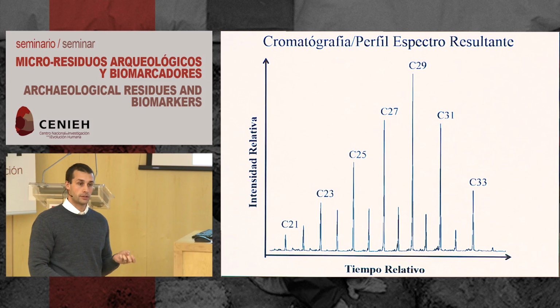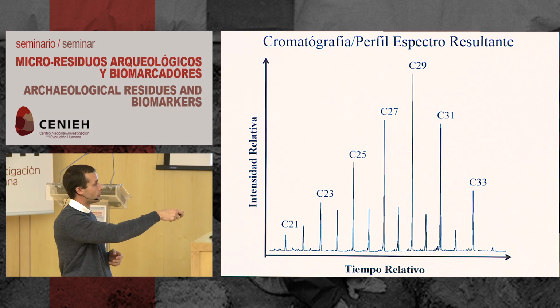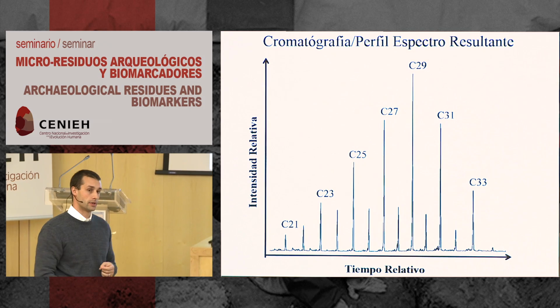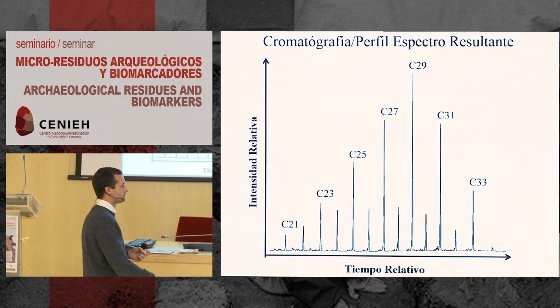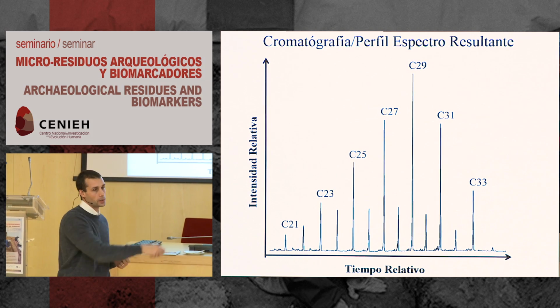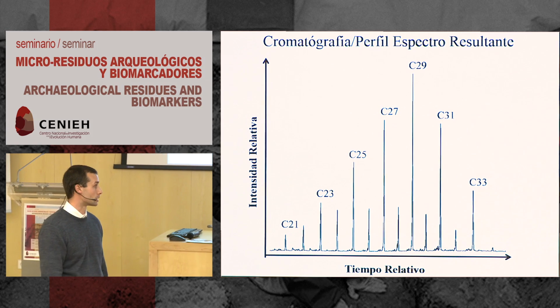For terrestrial plants, vegetation growing on the land, trees, shrubs, grasses, we expect to see a high range between C27, 29, and 31, and sometimes you even get a high peak for 33. Whereas the lower samples are coming from aquatic plants or emergent plants that live near shore.